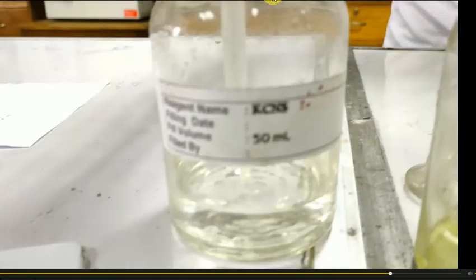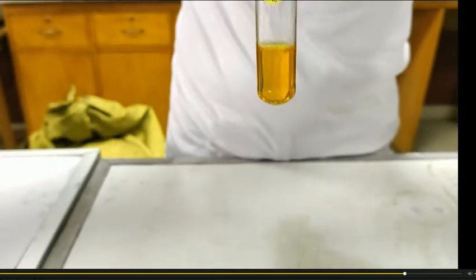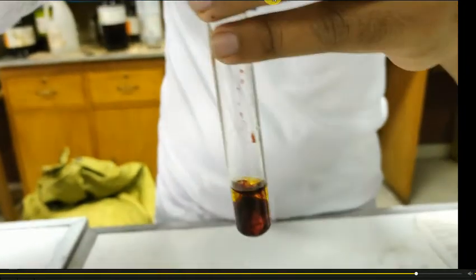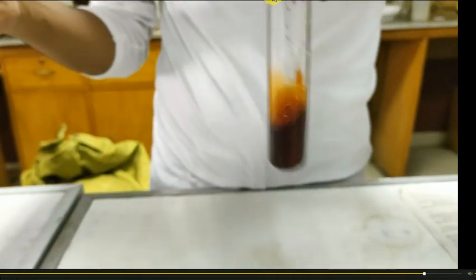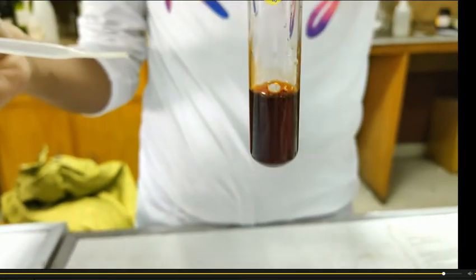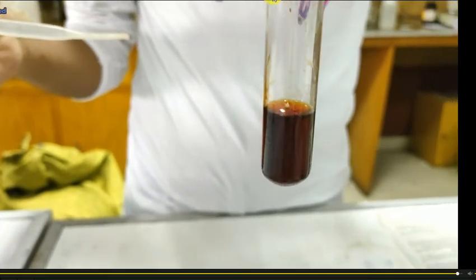In the sample solution we are going to add potassium thiocyanate, 1 drop of potassium thiocyanate. This will produce a blood red coloration. This is a blood red color. So this was all about the confirmatory test of ferric ion, and this indicates the presence of ferric ion. Hope you have understood how the ferric ion is confirmed in the sample solution.